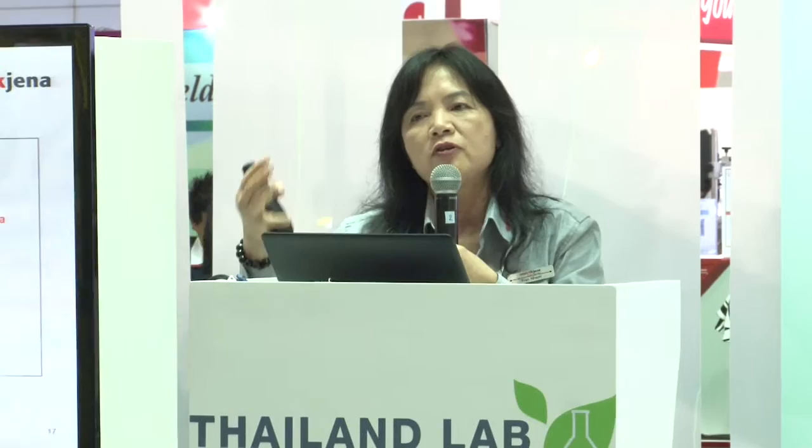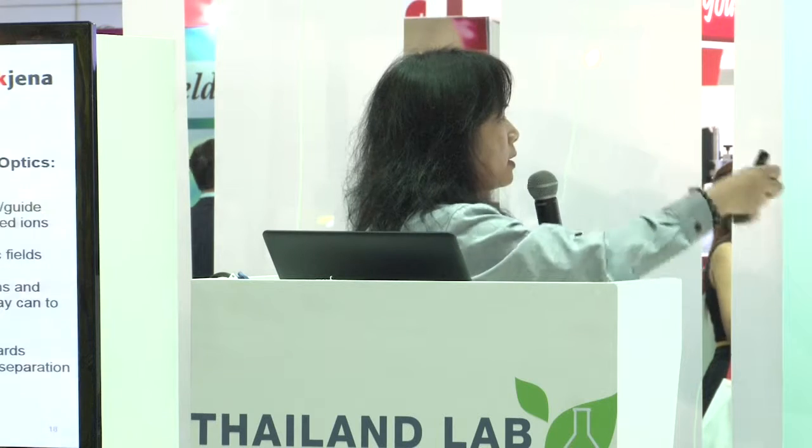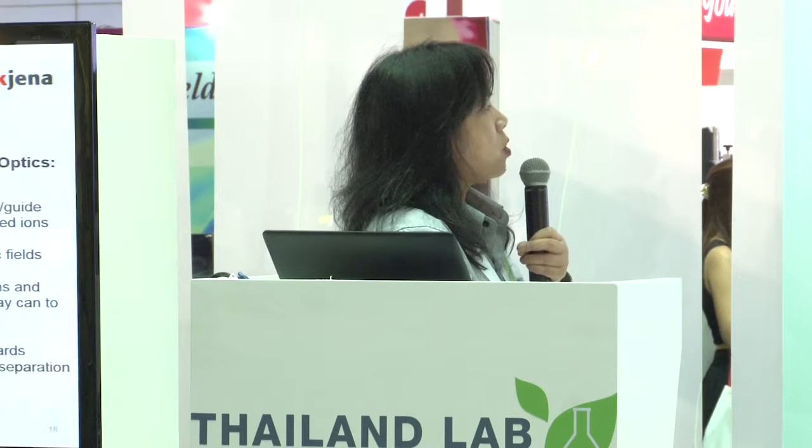All right. So when you hear people talk about KED, I minimize and remove my interference using KED, it is this sort of process. All right. So using this, I remove all my interferences. After my interferences are all removed, the ions turn 90 degrees into the so-called optics. The optics basically focus all the positively charged ions and let them go into the quadrupole. So all the photons and all the neutrals will disappear. And this way, all my ions of interest are able to concentrate and go into my quadrupole.